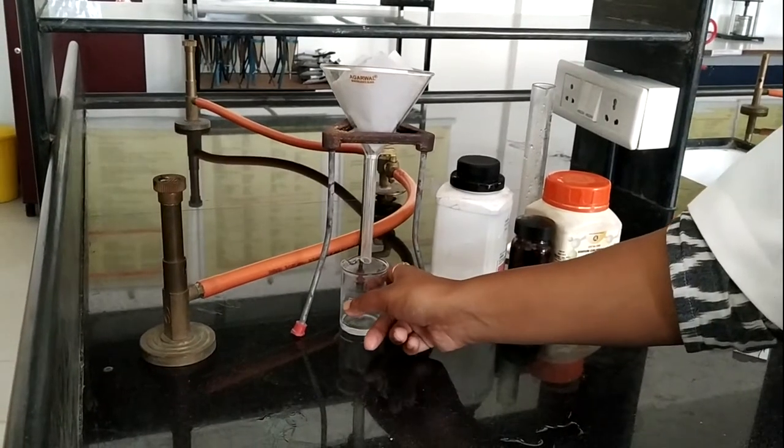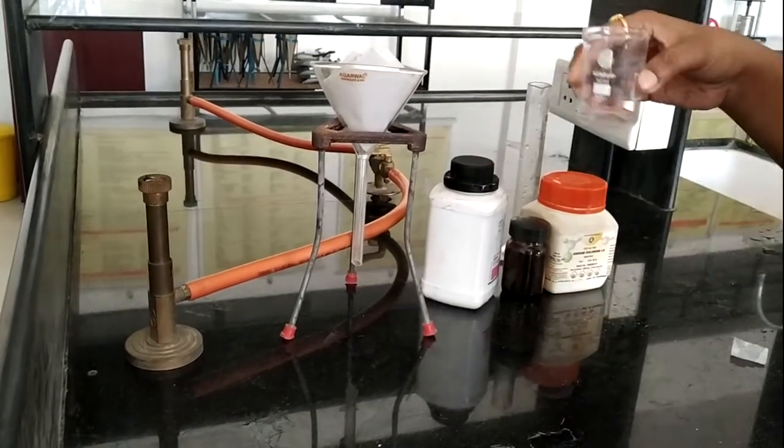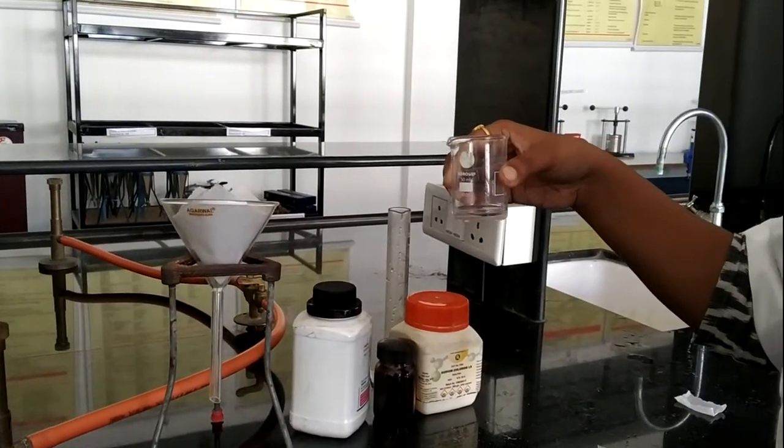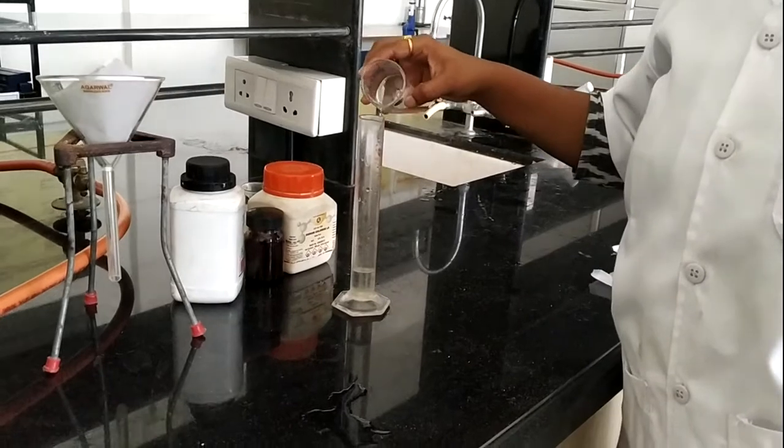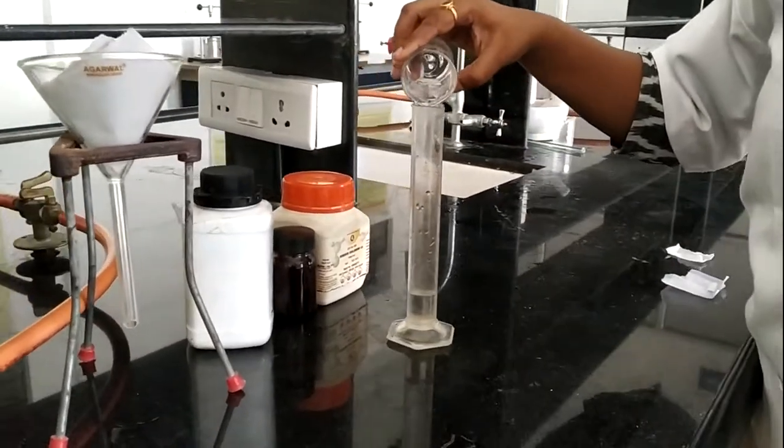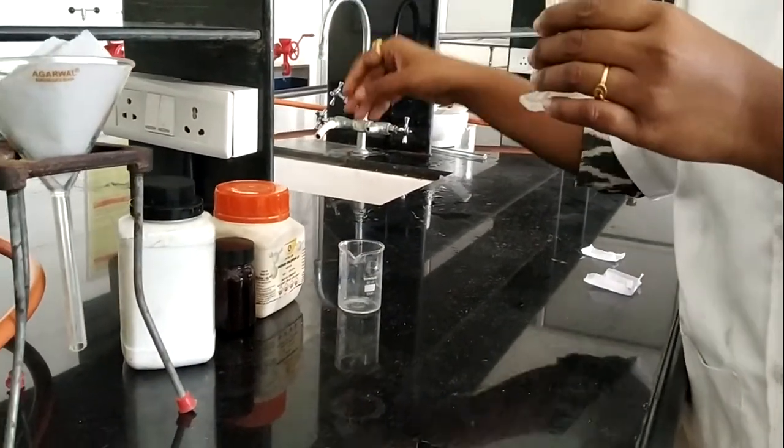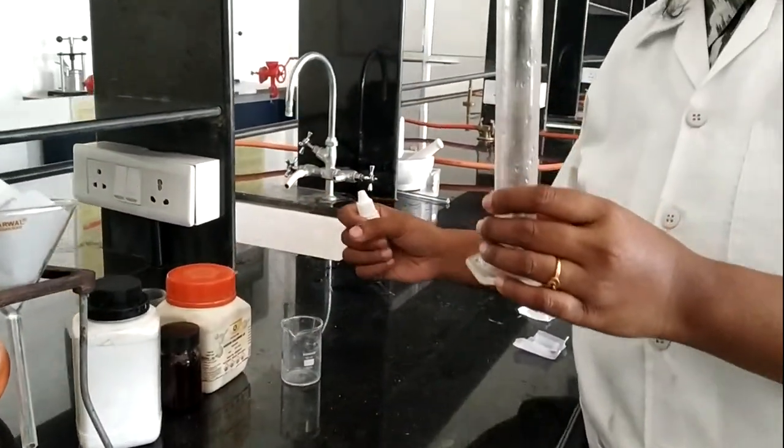After filtration, our filtrate is ready. Now let's proceed for volume makeup, and then we will pour it into container. Now make up the volume up to 10 ml into this measuring cylinder, and then we are going to pour this formulation into this bottle dropper bottle.